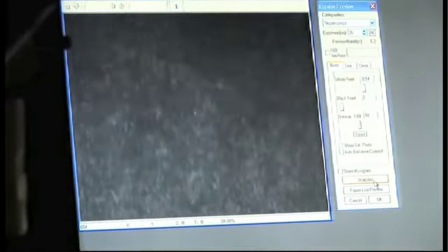With experience, it's possible to learn to estimate the cluster density by looking at the Flowcell in this way. The most helpful way is by saving SYBR images from a number of lanes and comparing them to the cluster densities determined for those lanes during sequencing. We put together a reference chart to help in estimating cluster densities at the SYBR step. The optimal cluster density depends on things like the project and analysis pipeline, but if you know your target density, you can use SYBR to QC.